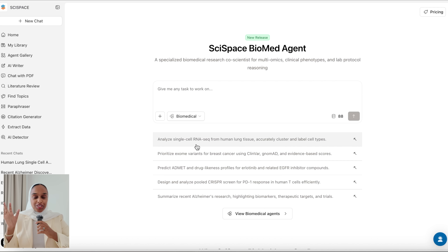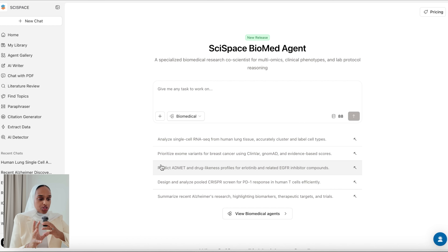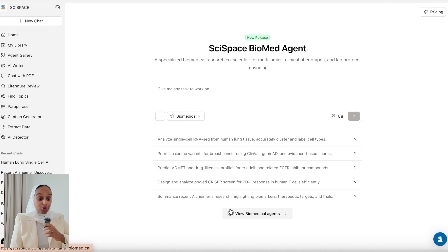I really think this could change a lot for the molecular biology field. It's really shocking how much information you can get from this. So let's go straight into the video. You can ask any task, give any kind of prompt related to biomedical research — there are some examples already provided for you.